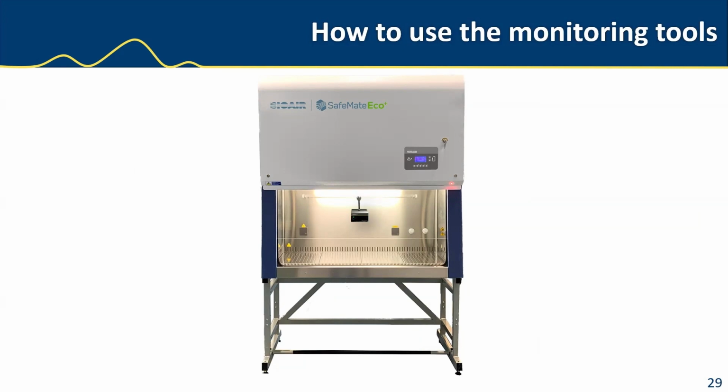There is a new guideline, a technical report that came out. It's ISO/TR 14644 part 21, and that discusses validation of the particle losses in the sampling system tubing. And there's a whole webinar on that topic. We did have some input as a company into the development of that technical report. And we have an applications page on our main website. You can scroll down and see how it's done. We actually also have some tutorial coming out on how to validate the particle losses, so keep your eyes open for that one.